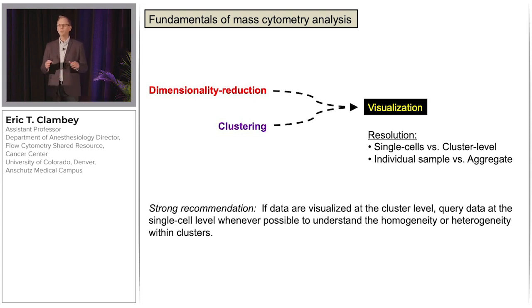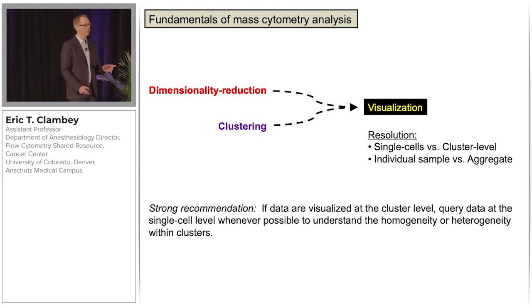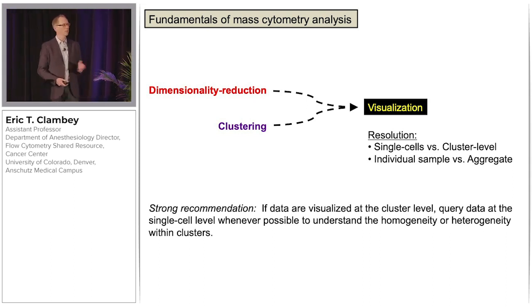So there are two fundamentals for current CyTOF data visualization, and they are dimensionality reduction and clustering algorithms. And it's the integration of these two methods that affords current CyTOF data visualization. Please note, however, that algorithms differ in terms of their level of resolution. Some afford single-cell resolution, others only afford cluster-level resolution. It's also notable, not all algorithms allow you to look at individual samples, and instead, they might only allow you to look at the aggregate sample.